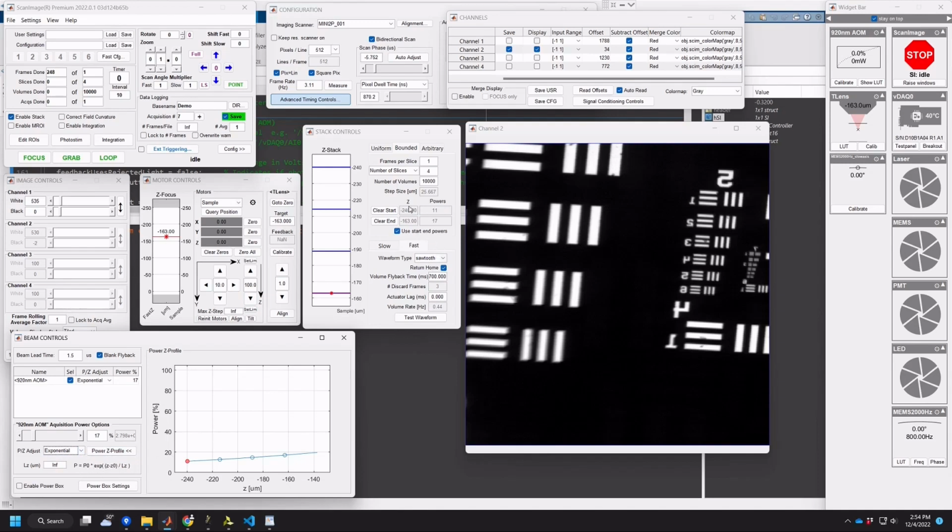We've used the 2 points defined here to define what this characteristic length would be, and we're able to interpolate for these other 2 depths what the power should be. So this would be a good way of defining slices as well.